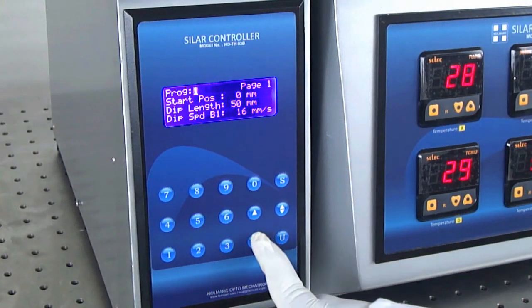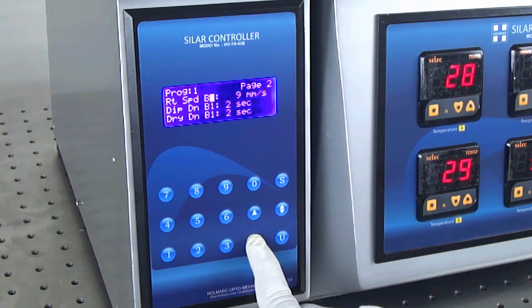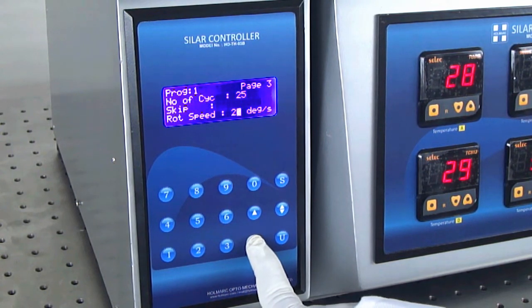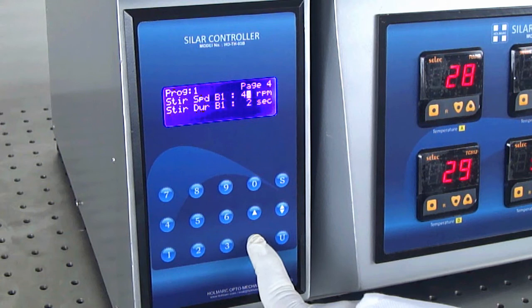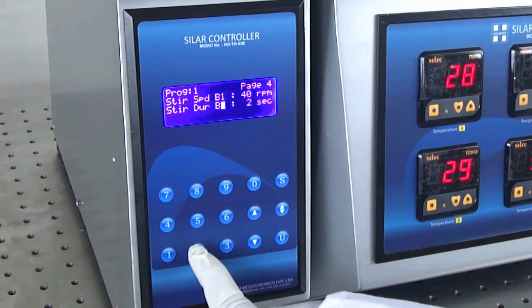The unit provides a user-friendly front panel with keyboard and LCD display to enter all process parameters such as dip speed, dip duration, length of travel, number of dips, etc. We can also set different values at each of the six dipping platforms.